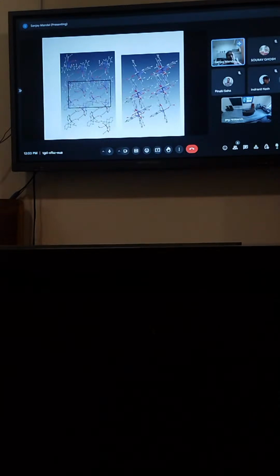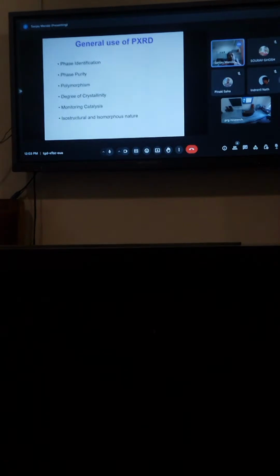Okay. Now finally, pi-pi interaction can also be looked at based on the 3D structure. Normally, if you have between 3.3 angstrom to about 3.9 angstrom between the rings, then that is valid. Okay, so we would be able to determine the 3D structure and all this stuff.